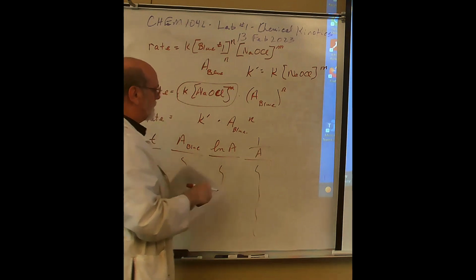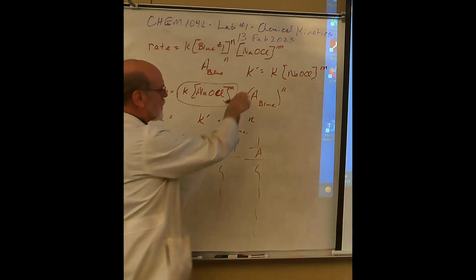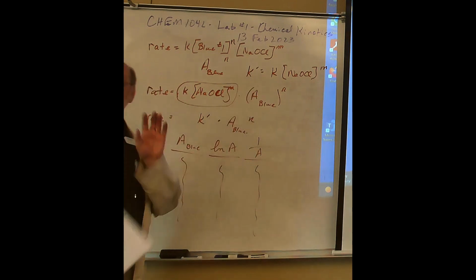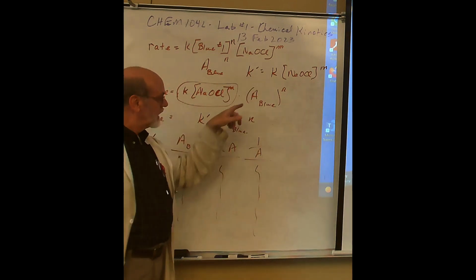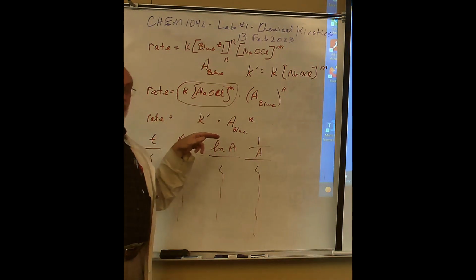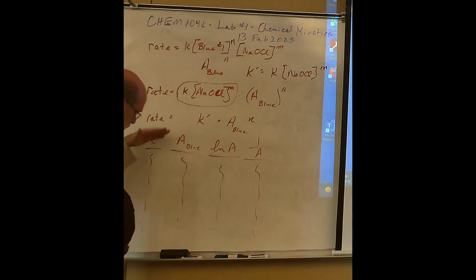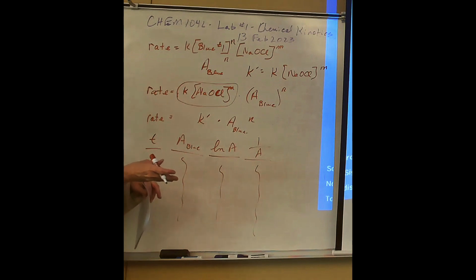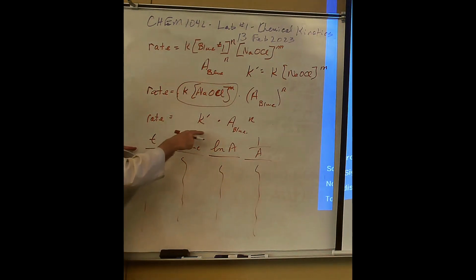And if you ratio, you'll get two different K primes because you're going to have two separate experiments. And this concentration will vary for the second experiment. So once you've determined the K prime, just like we did for this one, this would be for the first experiment, and then for the half strength bleach, you'll get another K prime, a different K prime, because you changed a concentration.